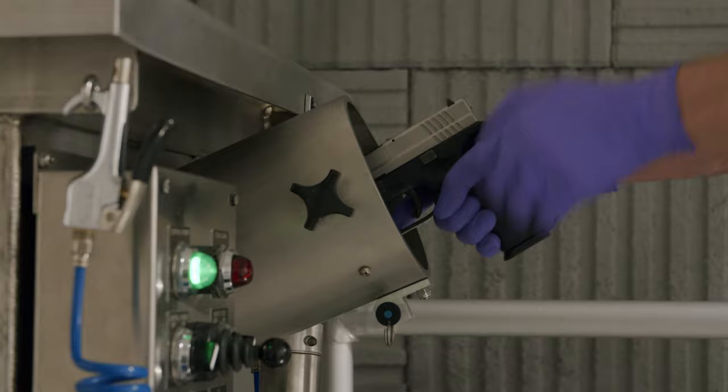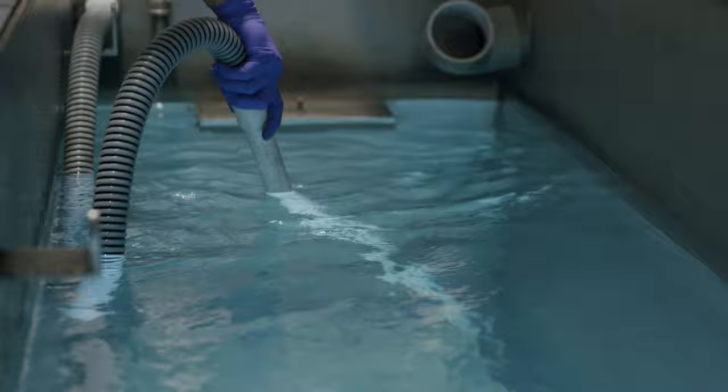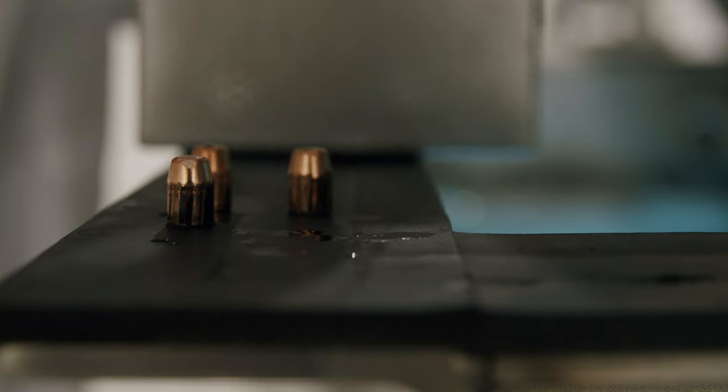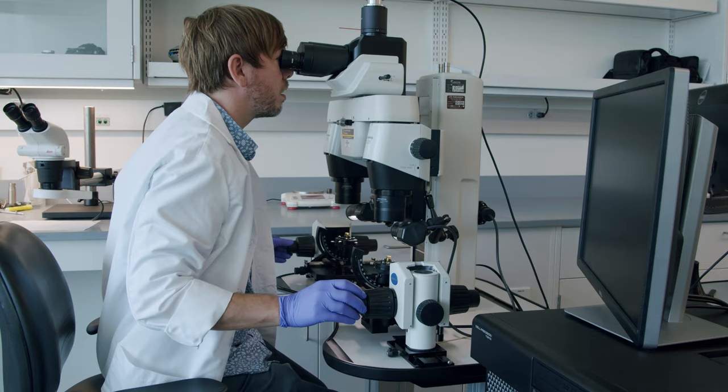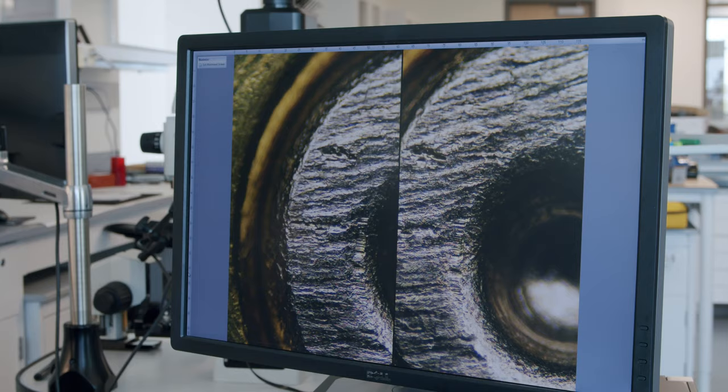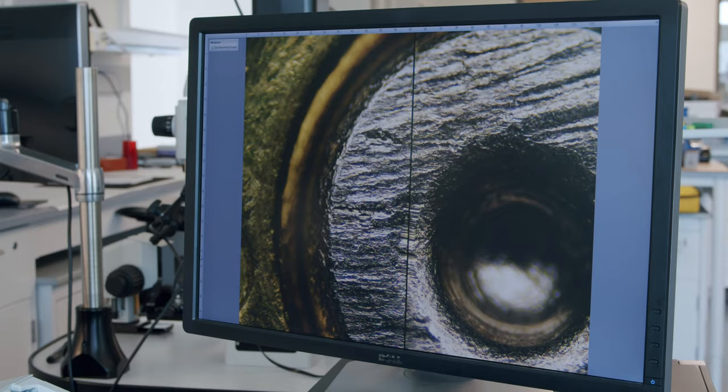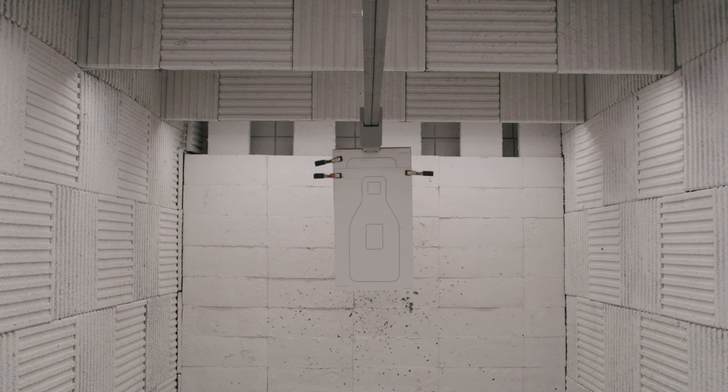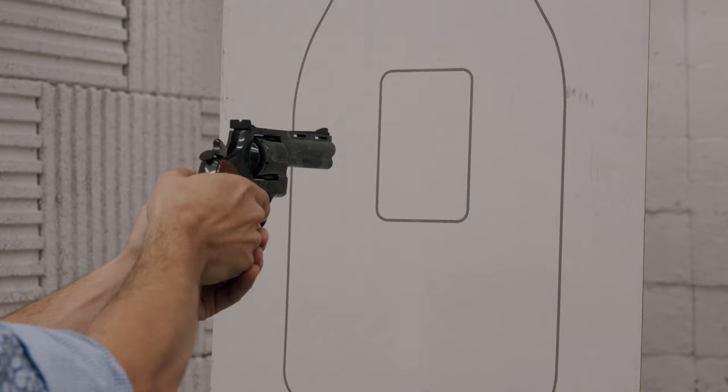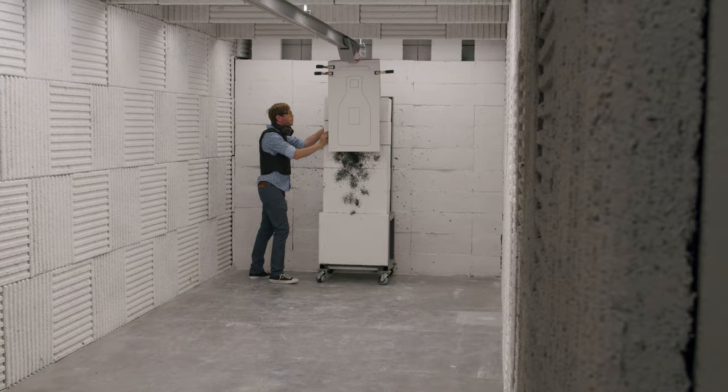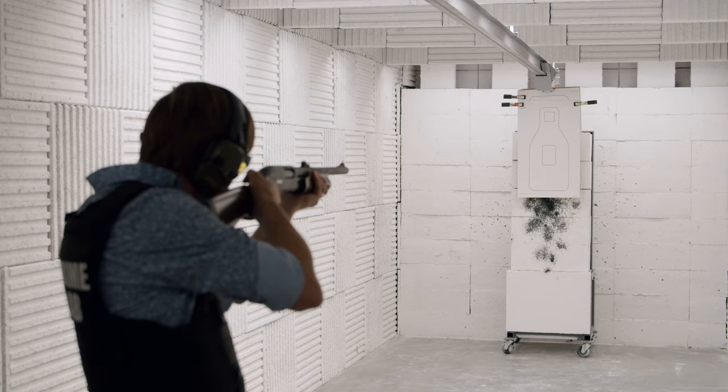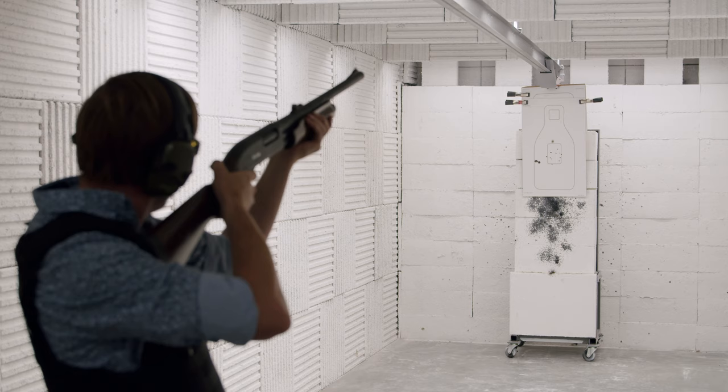It allows us to collect, in a lot of cases, almost pristine bullets that have all of their individual unique markings intact without any damage. I'll look at the evidence cartridge cases in comparison to the test-fired cartridge cases using a comparison microscope. We also have a range side where we can shoot into these heavy rubber blocks that encapsulate and contain the fired bullets. We can fire on that side if we just need expended cartridge cases and no bullets, or if we need to do additional testing.